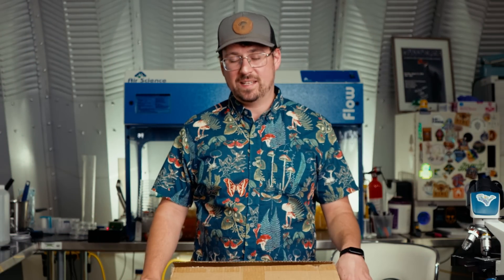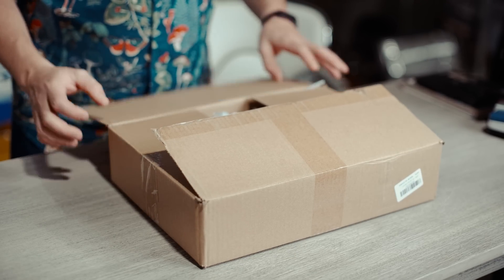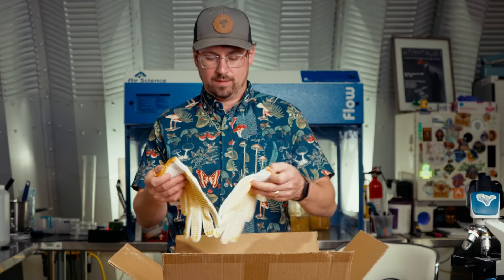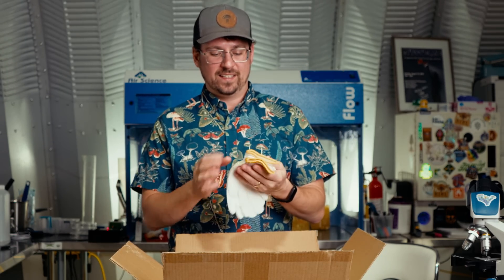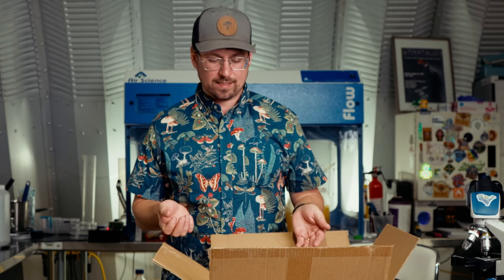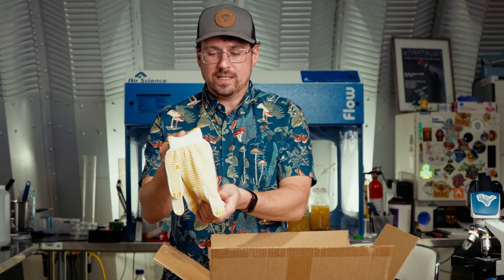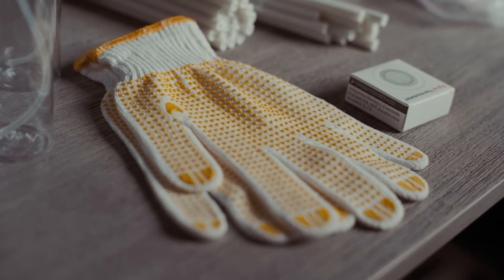So that covers the still air box basics. Now we can dive into this box. I've never used this — I'm just going to give my real-time feedback. The first thing I notice as we open this box is that there's some roadside-assistant-style gloves. I definitely would not use these for mushroom farming unless you're moving some heavy equipment. Ideally this would come with a latex or latex-free glove that you could sterilize. The biggest reason I wouldn't use these is because they're going to harbor contaminants inside the fabric. So I would say strike one.